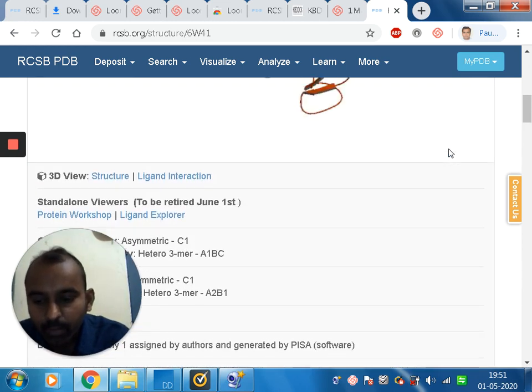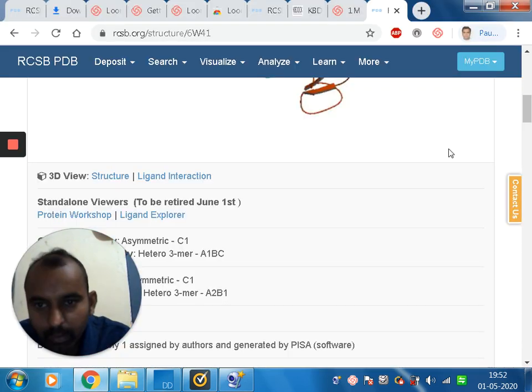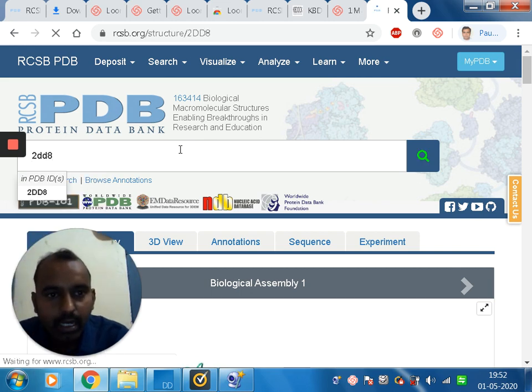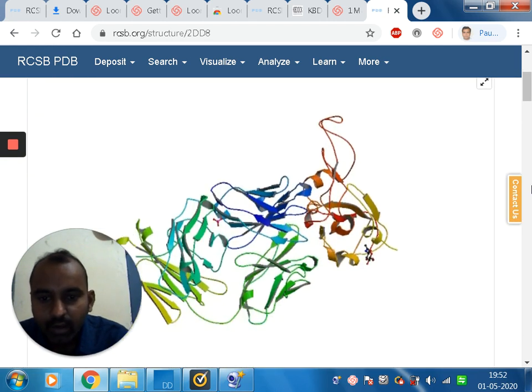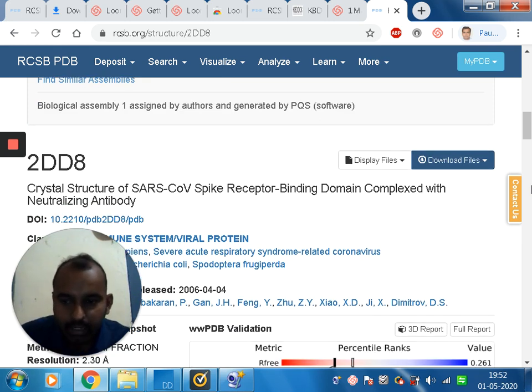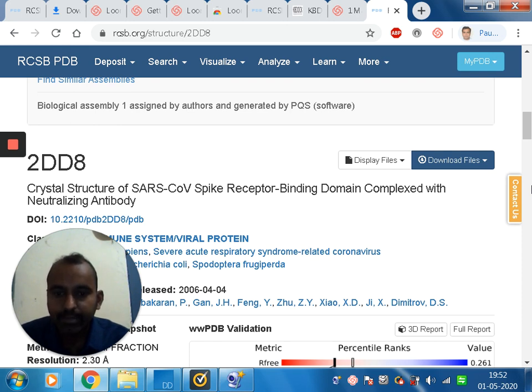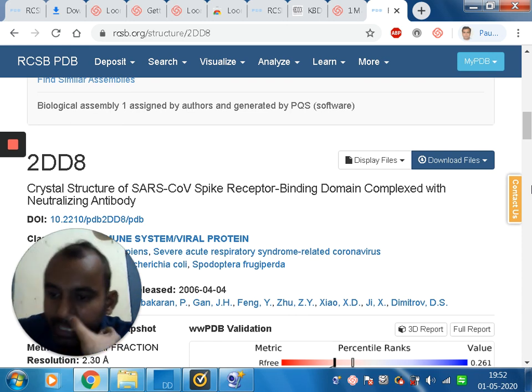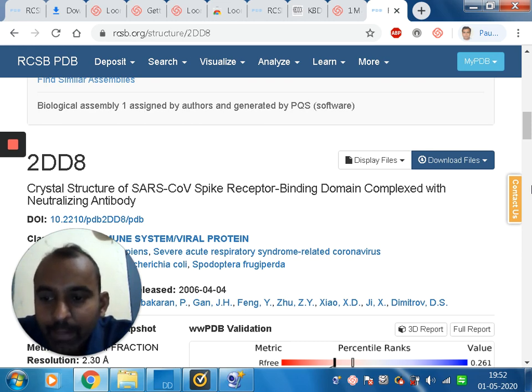Now let us look at one more protein of interest: 2DD8. Searching for 2DD8, the entry is the crystal structure of the SARS-CoV spike receptor binding domain complexed with neutralizing antibodies. Here it is SARS-CoV from 2012, whereas the earlier one was SARS-CoV-2, the novel coronavirus from 2019. These two viruses are different.